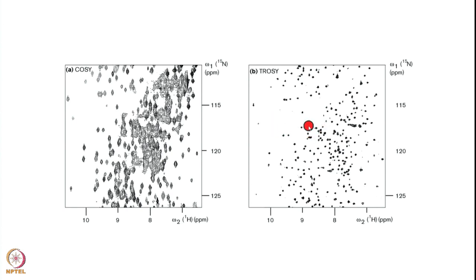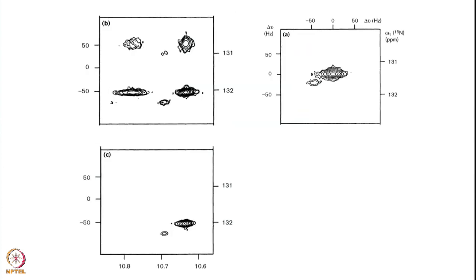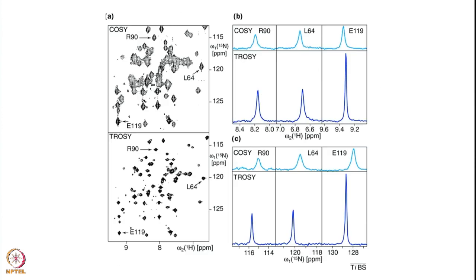Notice however that if you use very large spectrometer frequency for small molecules, you actually stand to lose. Why do you stand to lose in this case? I will show you that here. So you saw here that we are picking out one component of the 4. In the normal case, we are getting contributions from all the peaks here. If you are working with a small molecule, then all these components do not have very different intensities. Therefore, when you decouple, this will be a very sharp peak with high intensity. At 1 gigahertz or so, if you did a TROSY experiment on a small molecule of 10-20 kilodalton, then you are throwing away the intensities of all of these and picking out only one, so of course you tend to lose intensity. So therefore, we should not do that. You should use TROSY only when you are working with larger systems, and then go to higher spectrometer frequencies.